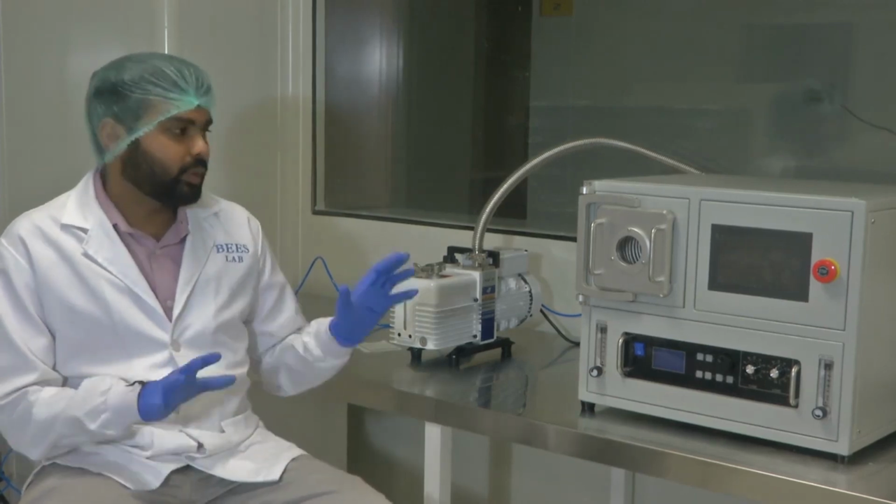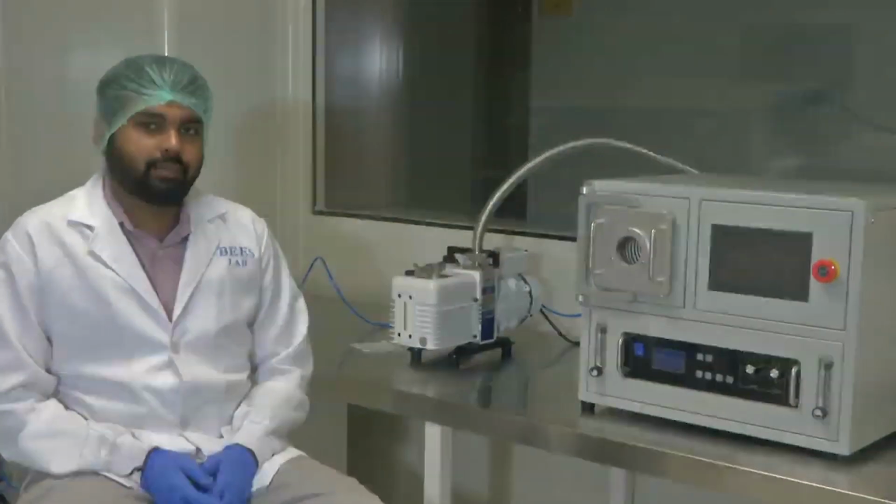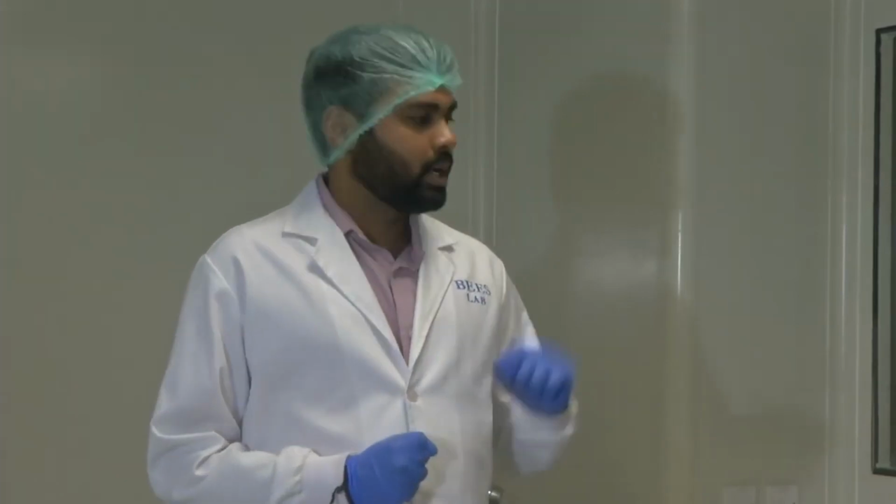Now we will get into individual blocks of the actual system and let's see whether we can create plasma. So now we are going to the fun part. Let's try to operate the system and create plasma in the oxygen plasma system. As I'm just repeating, we have the main system here.